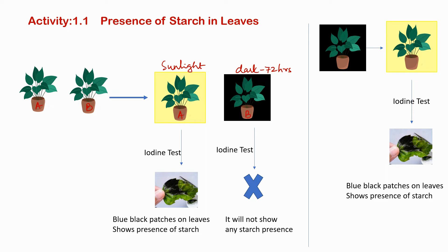After keeping Plant A in the sunlight for some time, we perform the iodine test. We pour two to three drops of iodine on the leaves, and as we can see, it gives us blue and black patches on the leaves. That means there is a presence of starch in this leaf.